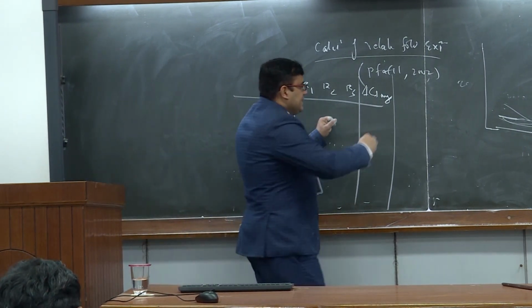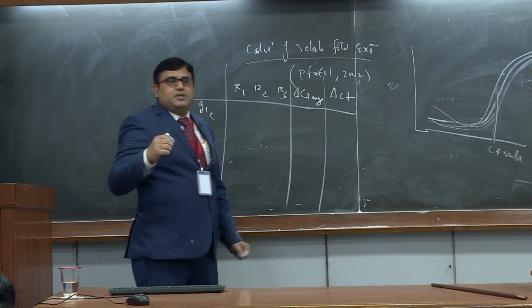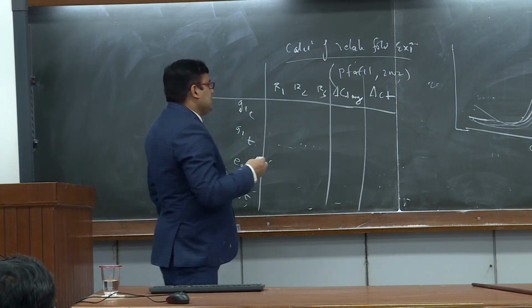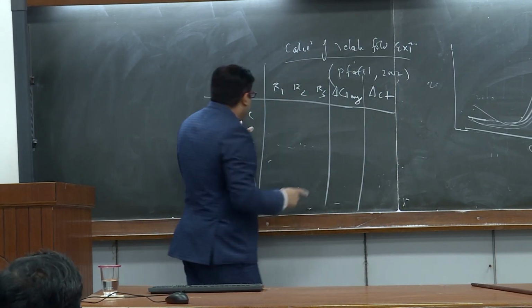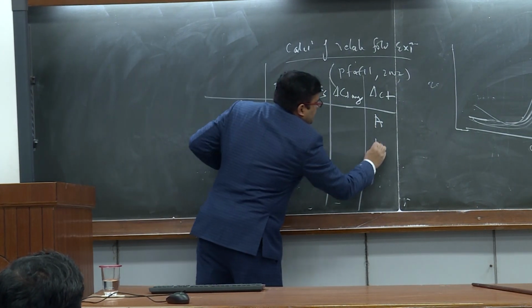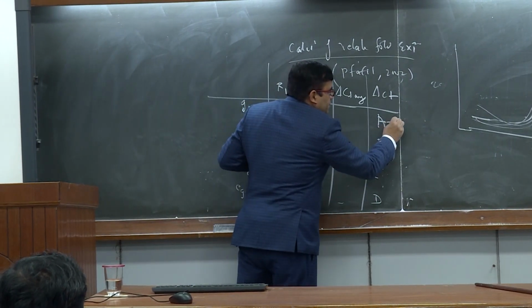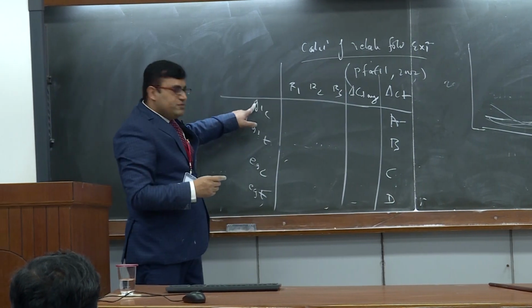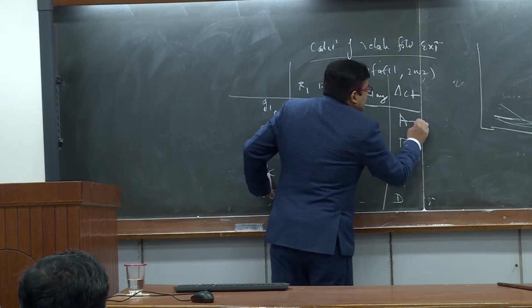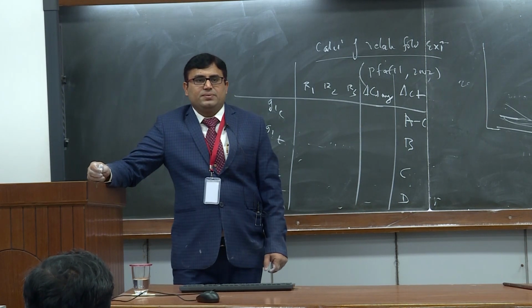Once you calculate the average, there is a term called delta CT. Delta CT means differential of threshold cycle value. Suppose these values are A, B, C and D. The value comes when you subtract the endogenous control from the control of the gene, so A minus C is your DCT value, or differential CT value.